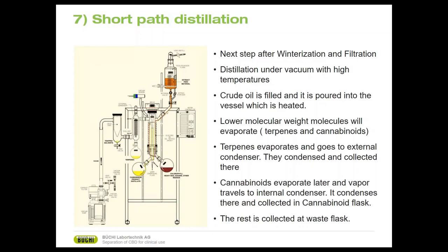But if you are using short path distillation, the simple version, it works like a rotary evaporator on the benchtop, but with a much stronger vacuum source. Then you can set your temperature low to remove the terpenes, and then you can increase it. Once you remove all the terpenes, you must switch the flask, and then you start to collect your cannabinoids.